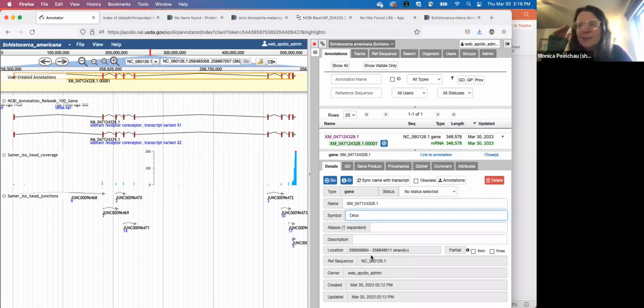But basically, this is when you all have decided these are the genes that we think are worth changing in NCBI, whether it's through their structure or their name or both, or just adding a new one because you thought there's a new isoform or this model was not in the reference data set at all, and we have evidence to suggest that it is. So once you've made that call, and I can help you decide if it's worth making that call, then I have to do one or two things.